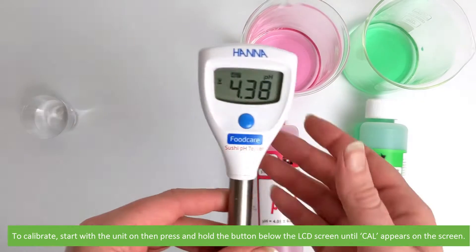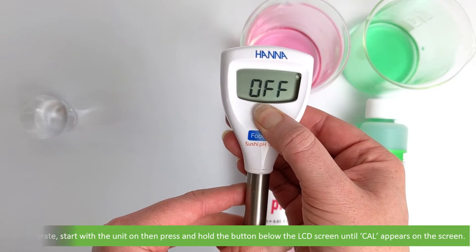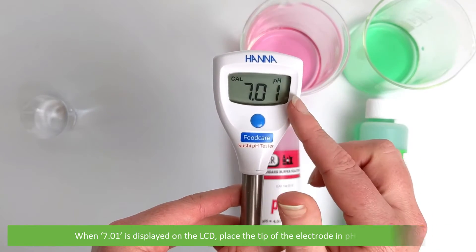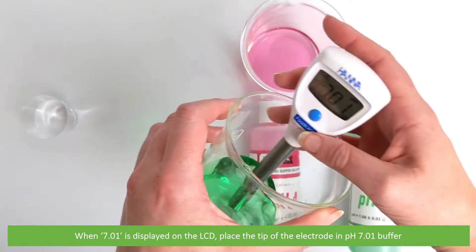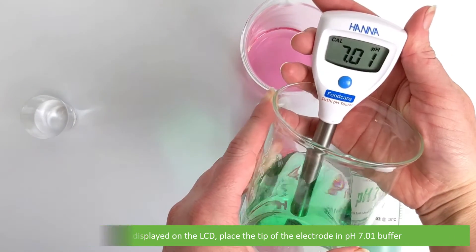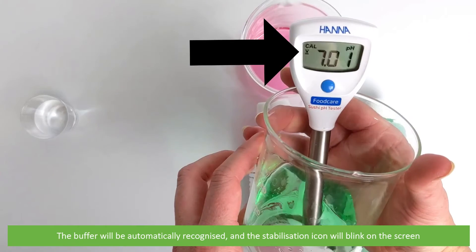To calibrate, start with the unit on. Press and hold the button below the LCD until CAL appears on the screen. Then 7.01 will be displayed on the LCD. Place the tip of the electrode into PH7.01 buffer. The buffer is automatically recognised and the stability indicator will blink.